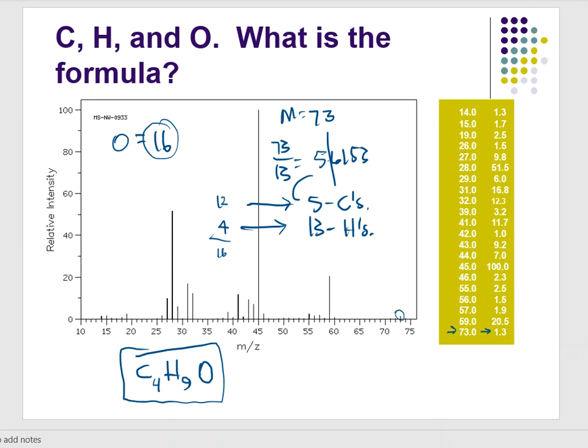If it tells me 2 oxygens are present, I'll just do it again. Take away another carbon, take it to 3. Take away 4 more hydrogens, take it to 5. And then slap on another oxygen to the molecule. That's the only thing. You're trading off the weight. That's it. You're starting off with carbon and hydrogen only. You're adding maybe an oxygen.